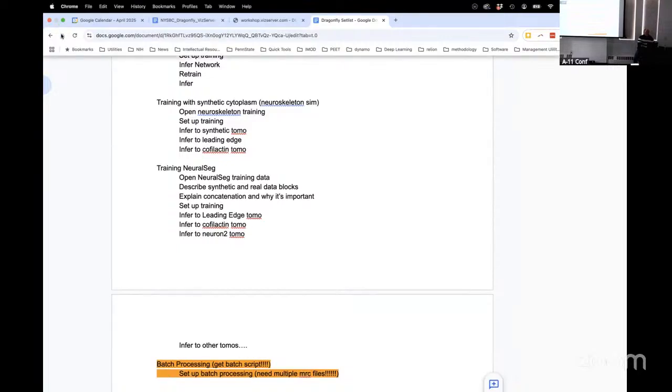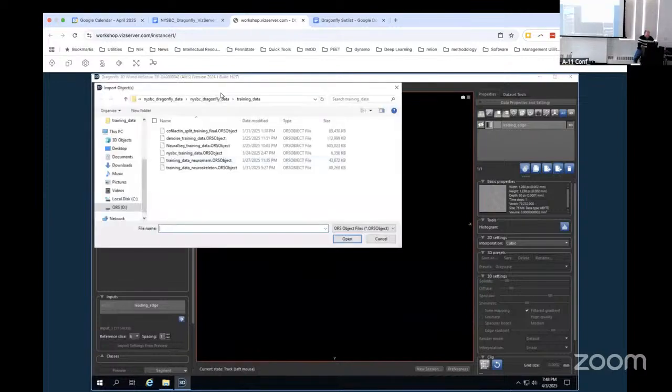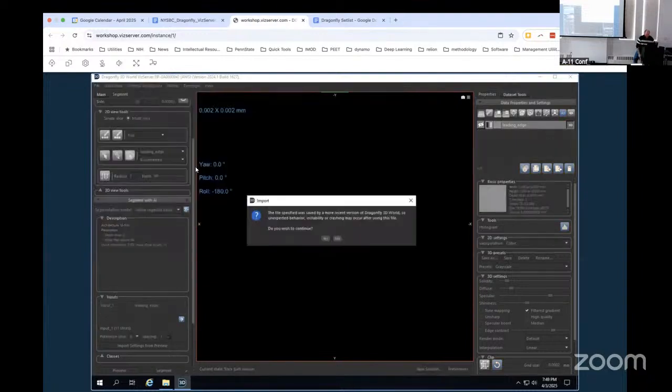Okay. So let me show you this. How do you get into a cell with nothing but synthetic data, right? What I'm going to do is we're going to open up training data called training data neuroskeleton.